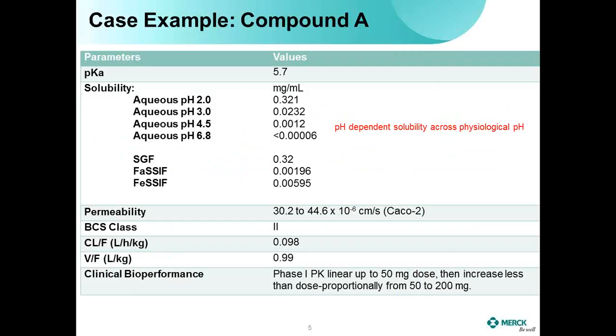As we continue this journey on developing and optimizing the biopharmaceutical tools for achlorhydria evaluation, we have used the PBPK-based absorption model incorporated with in vitro dissolution data of low buffer capacity citrate buffer to represent the achlorhydric conditions and tested our in vitro in silico models with several in-house and market compounds.